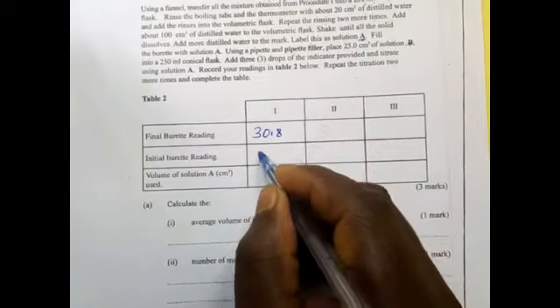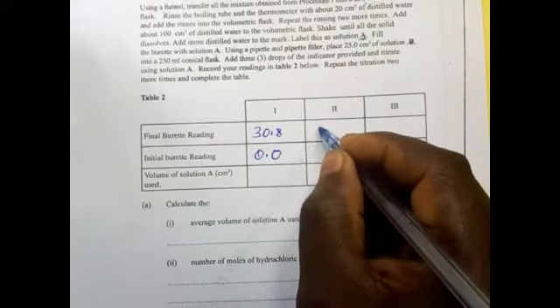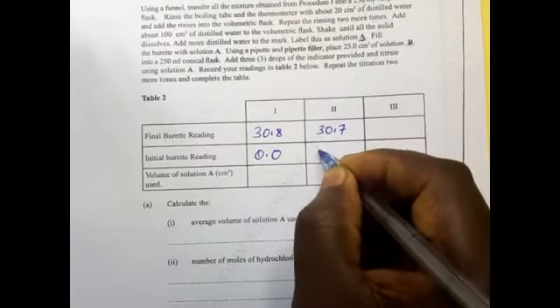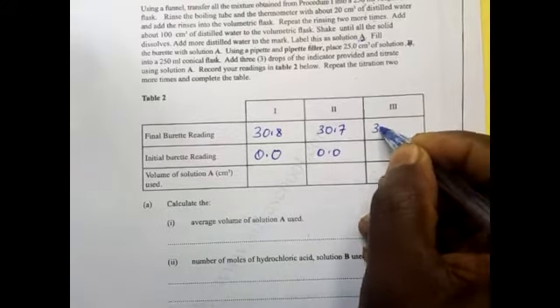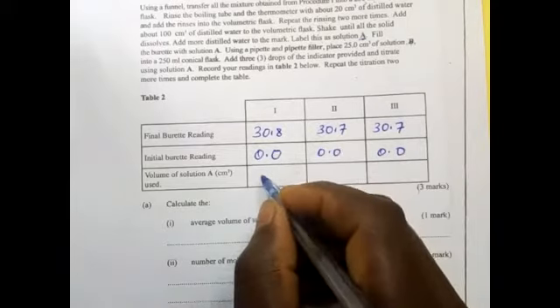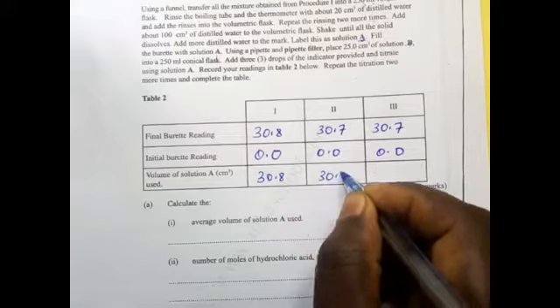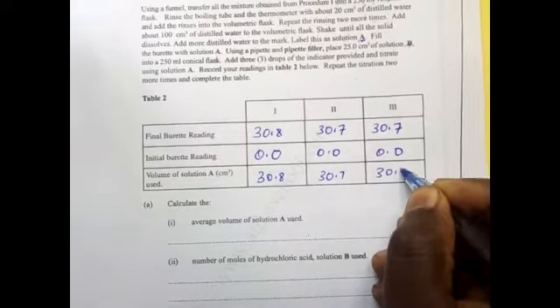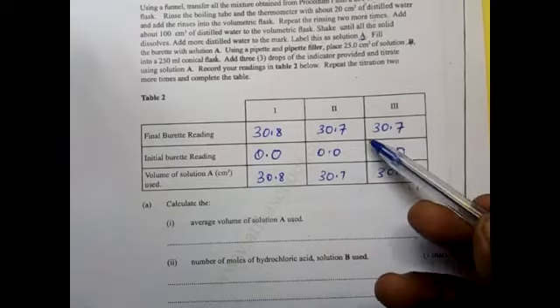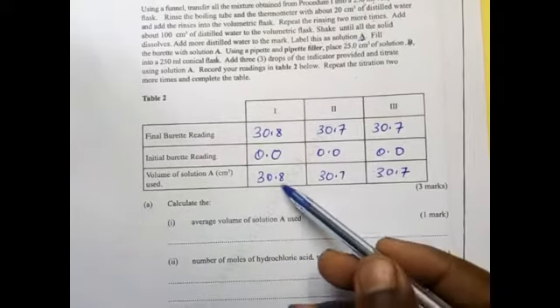30.8. Our initial, it is okay if you start at 0.0, 30.7, 0.0. Do the arithmetic. 30.8, 30.7, 30.7. Because I can see these two are the same, and I want a very accurate answer, I will do the average with the two and leave this one outside.